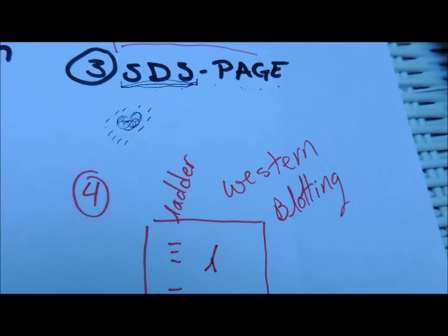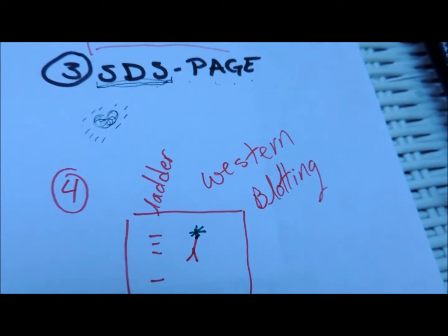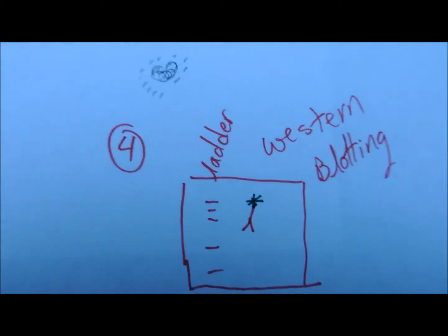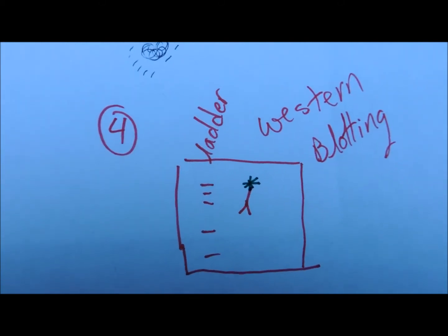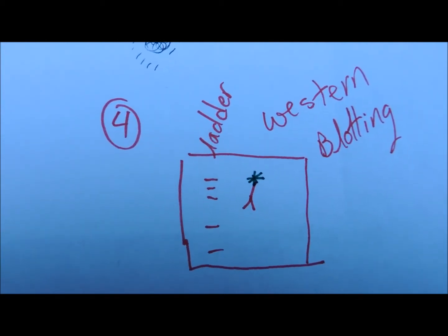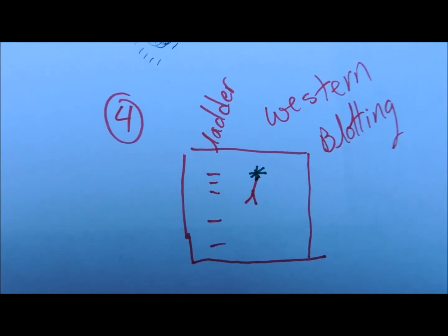What I would do next is try and cause it to glow. Again with the glowing, it's very easy to see things when they're glowing. Once I have this glowing, I'll be able to see where on the membrane it's located. In order to record that so that I can use that information later, I will expose this membrane to photo paper. Just like you would if you were developing old school photography paper.